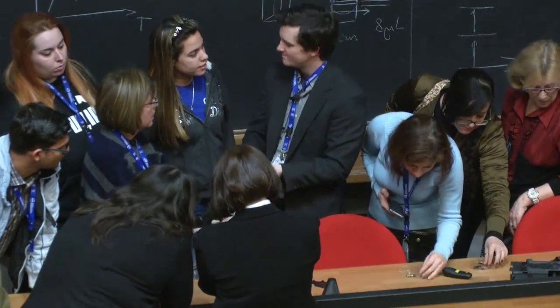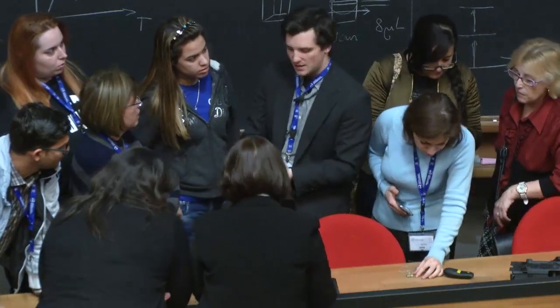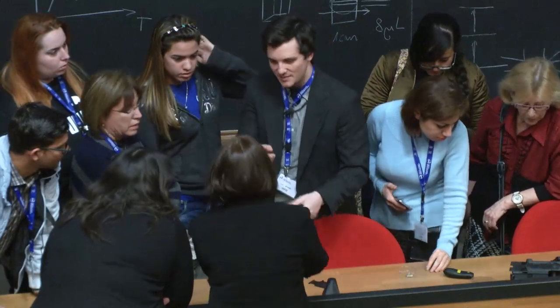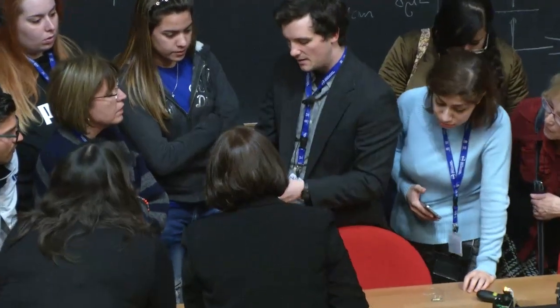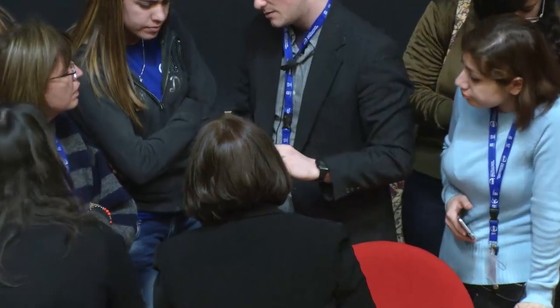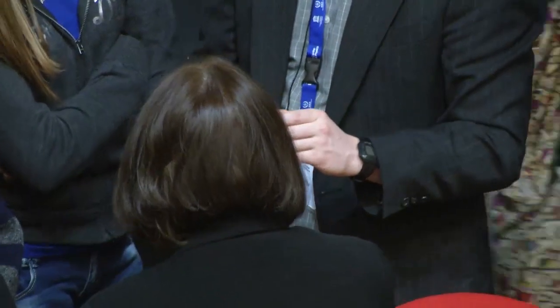And the DNA? The DNA is done on just a glass slide, and it slides into this device here. It's just a conventional glass slide. You put a drop of DNA, and then take a cover slip and push it. That stretches the DNA, spreads it around.